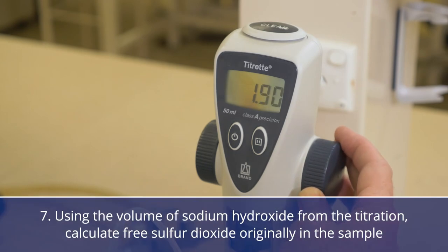Using the volume from the titration, calculate free sulfur dioxide originally in the sample.